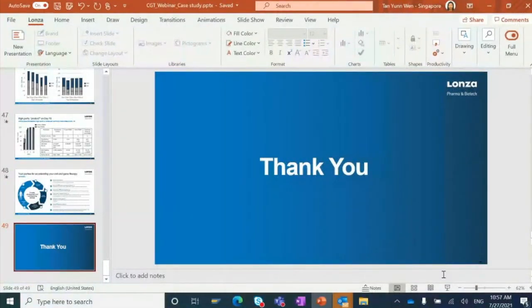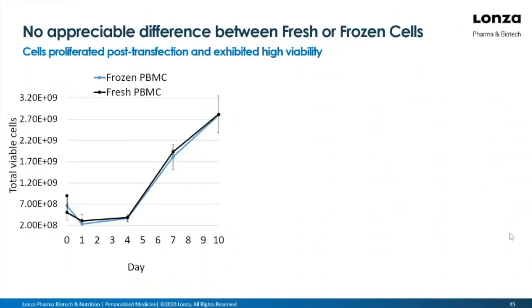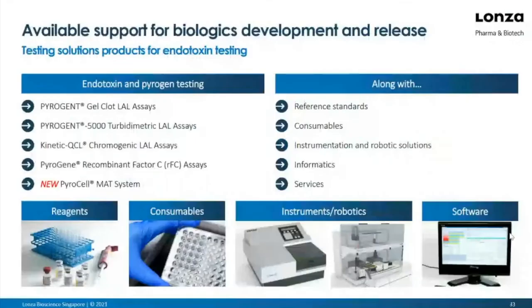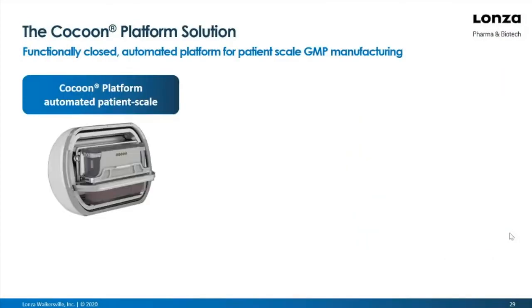Right, but Yunnwen, I have a question on the cocoon system. Is it like if the cells were cultured in suspension? Because I heard earlier you were saying they were shaking the system. So the system when it's closed is able to shake like a wave system, so you're trying to do the shaking to allow more media to go through evenly. But usually people use the cocoon system for suspension cells.